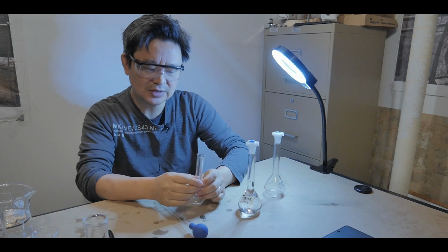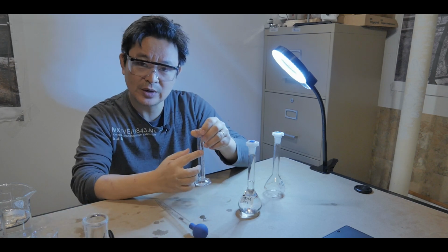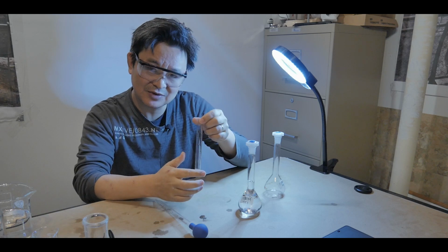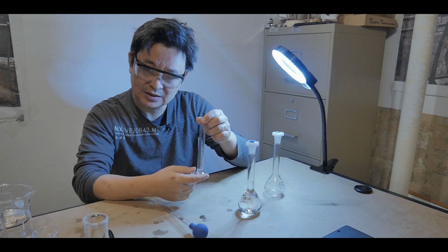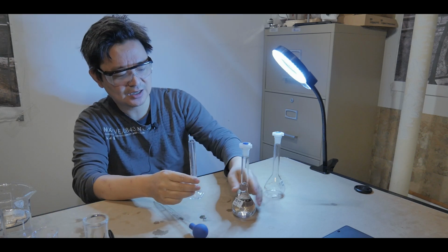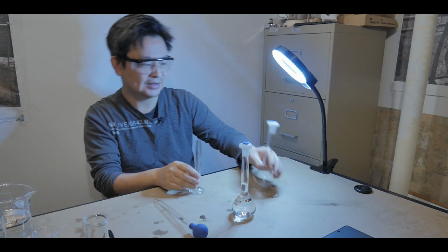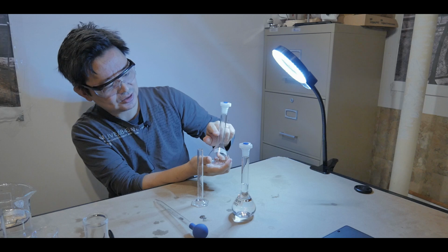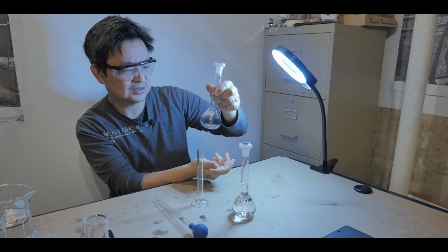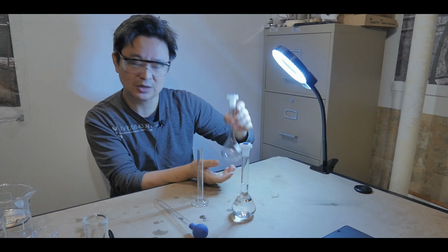You can use a graduated cylinder. This one is 10 mils, plus or minus 0.2 milliliters. So this means that this is not a very accurate instrument. You can use it. You can pour 10 mils of 1 molar concentration into there and add 90 milliliters of water, or up to that marking, to fit in 100 mils, and then you'll get 0.1 molar concentration.